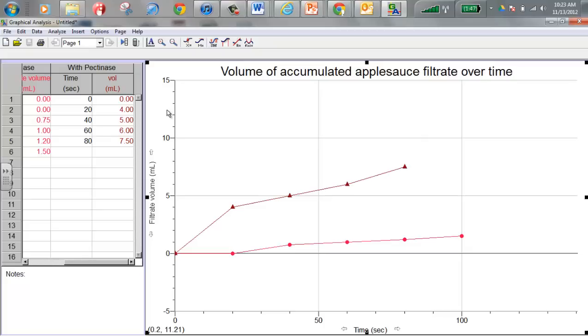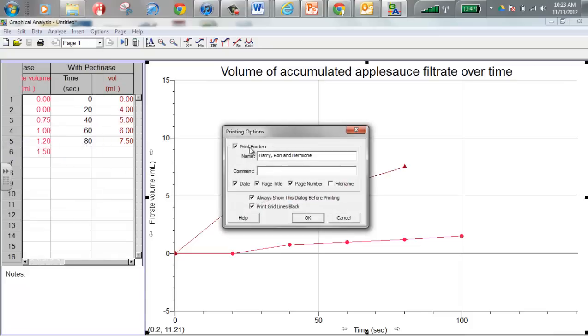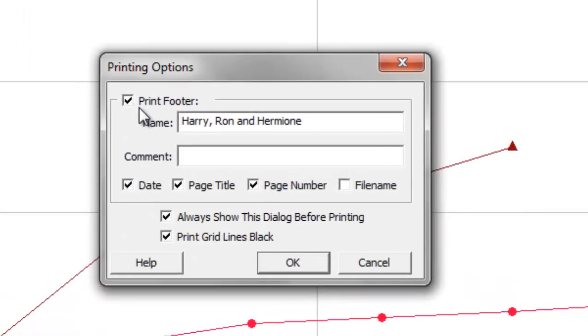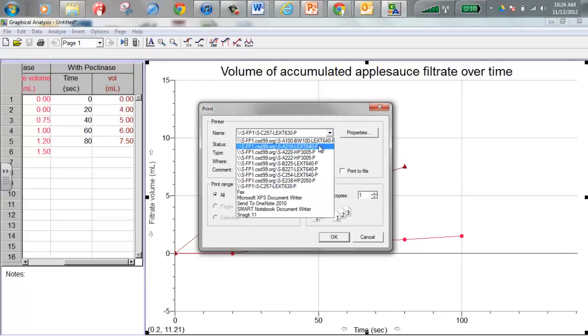The other thing you're going to have to do is print this. So to print it, there's a couple things you need to do. Hit File and Print. What will come up is a Printing Options window. I'm always going to want you to select this to print a footer - a footer is something that's at the foot of the page. What you need to do is put the names of the group members in here so that I know whose graph is whose, because they're all going to look pretty similar, especially if you all name the title the exact same way. I put Harry, Ron, and Hermione in there just as an example of a group of people that could work together and get things done, although Harry and Ron sort of rudely always let Hermione do all the work in many circumstances, don't they?